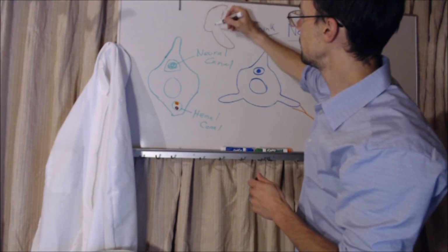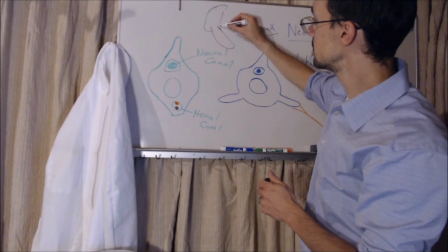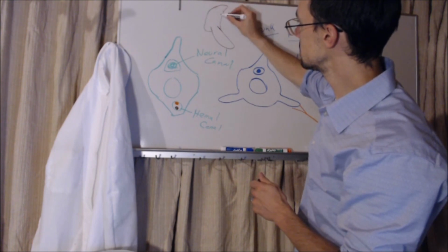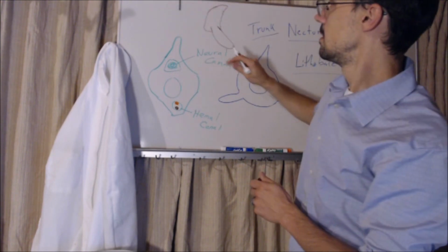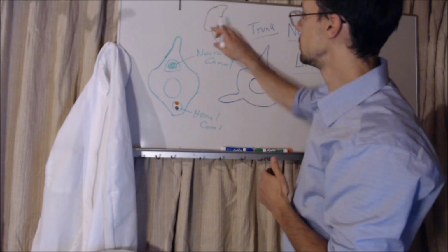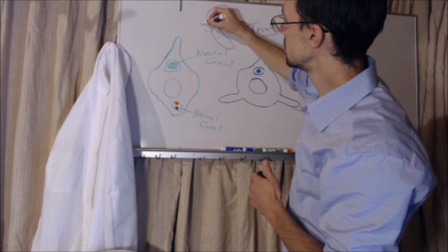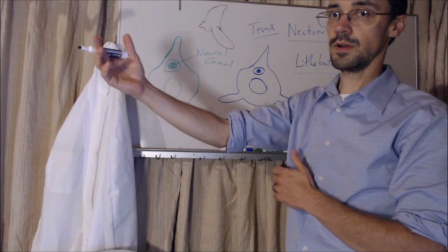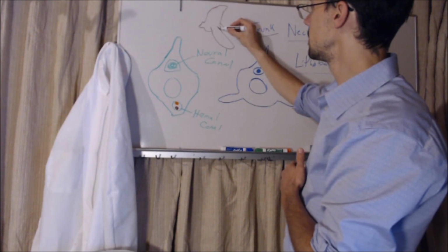So I'm now looking at a lateral view here. Here's my transverse process. Here's the centrum. Up here would be the neural process. Spinal cord's running through this area. So I'm looking at the side of all of this. If I were to do this, I would notice that there's going to be a process that runs off the front, the anterior portion, and another one that runs off the posterior portion.